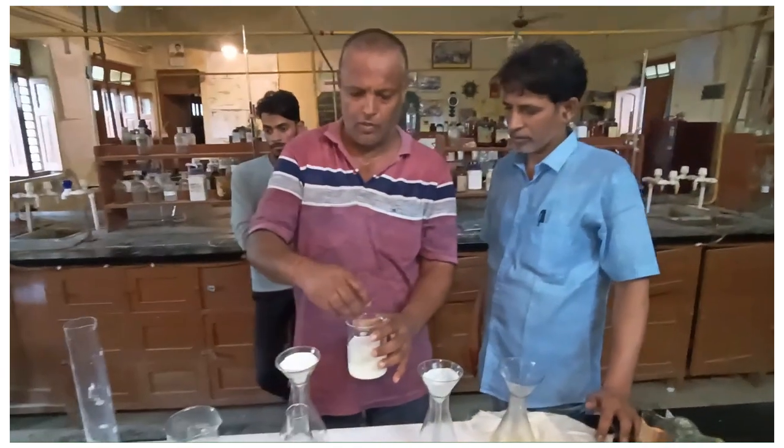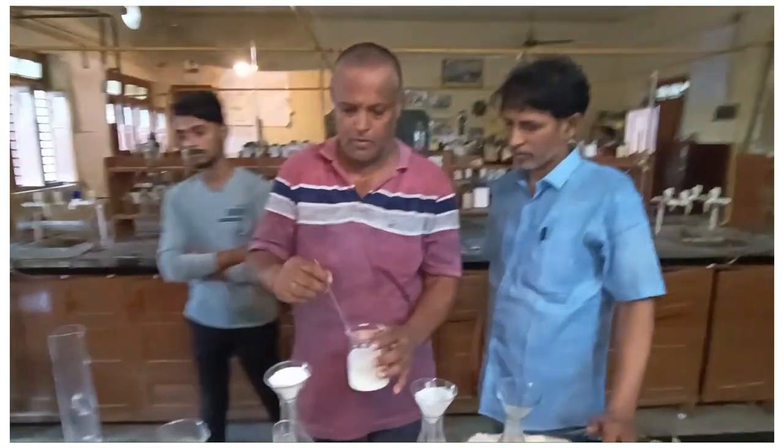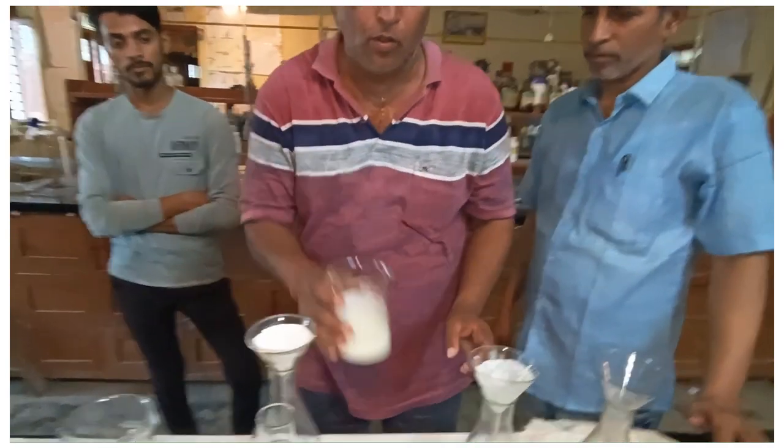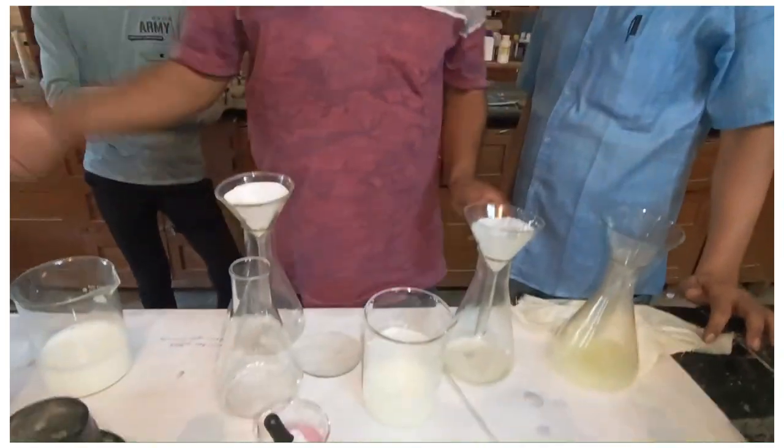Okay. Now you have to let it settle down. We have to filter it and let it settle down for 4 to 5 minutes. Okay. Now take another thing.